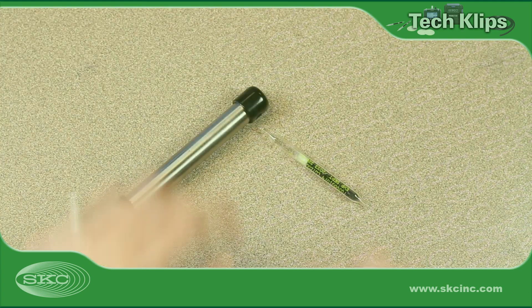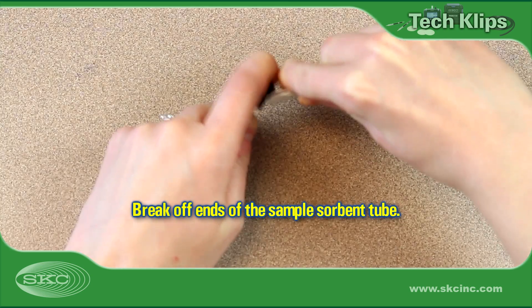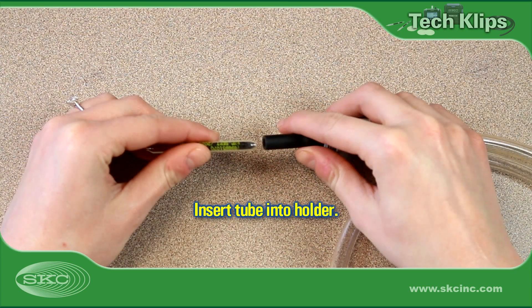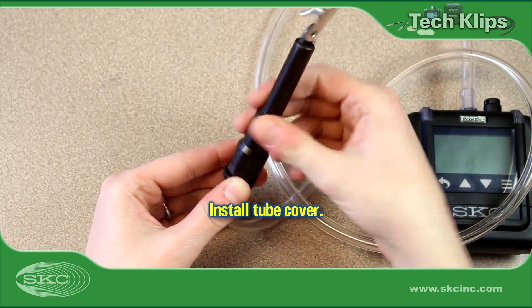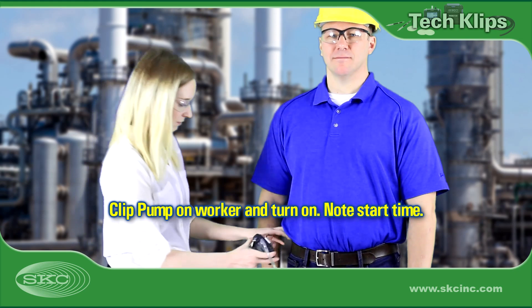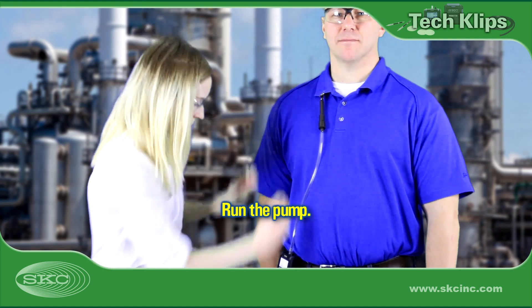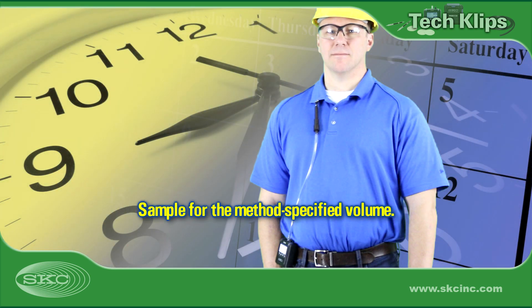We are almost ready to begin sampling. Immediately before sampling, use a tube breaker to break off and retain the ends from the sorbent tube that will be used to collect the sample. Insert the sample tube into the holder just as you did for calibration, ensuring the arrow printed on the tube points towards the pump. Thread an appropriately sized tube cover onto the holder. Attach the pump at the worker's waist and turn it on. Attach the holder in the worker's breathing zone and run the pump. Ensure the tube is in a vertical position for efficient collection of gases and vapors.